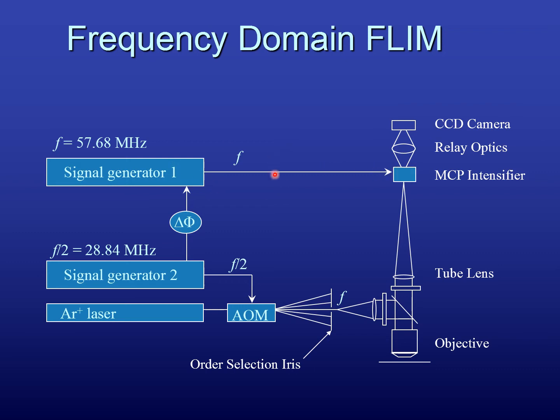And you're phase stepping it, so you're acquiring several images. There's also another technique called heterodyne, where you detune that frequency a little bit, and then you're quickly measuring. So in effect, it's really the same thing, whether you detune the frequency with a heterodyne technique, or you keep the same frequency with homodyne. It doesn't really make a big difference. It's just a different way of thinking about it.